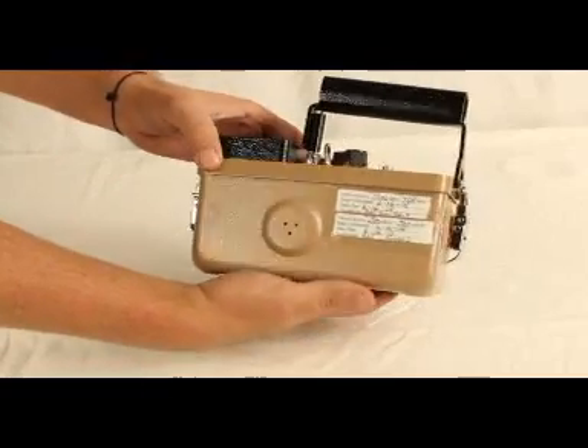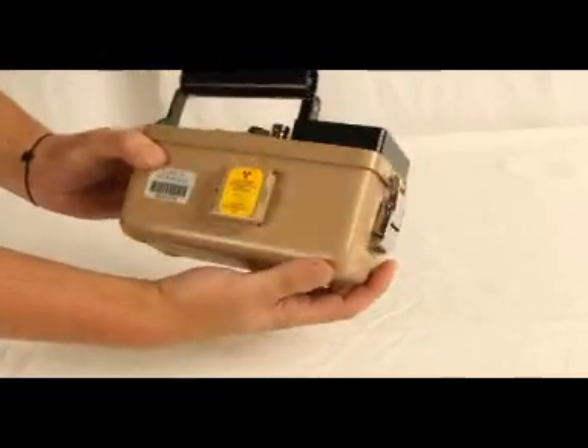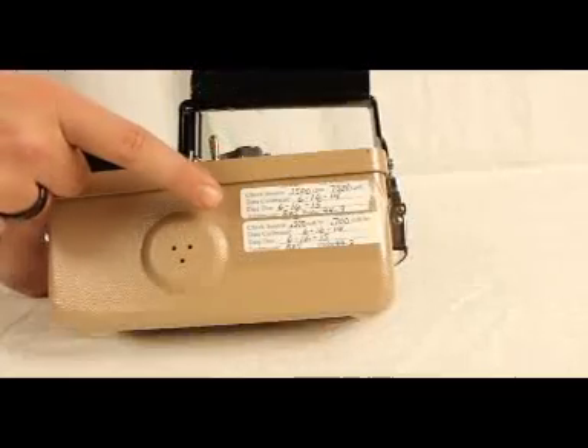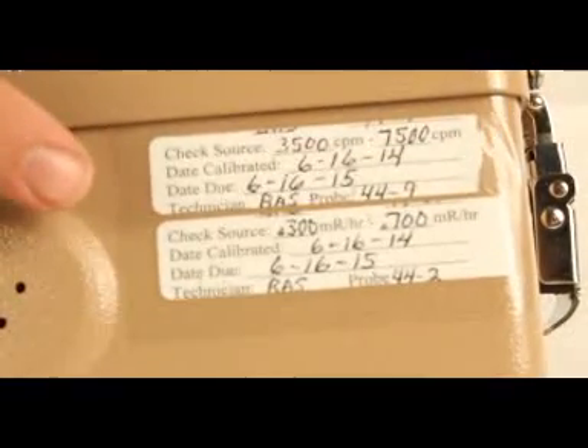Before utilizing this piece of equipment, first look at the device for any obvious damage from the previous use. If damage is found, do not use the device. Check the calibration date. If the date of use does not fall between these dates, do not use.